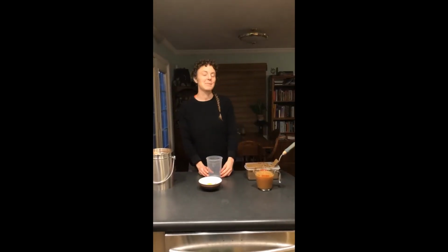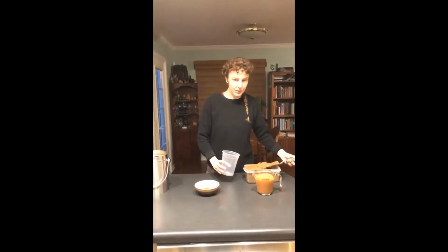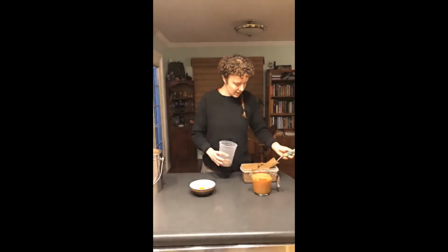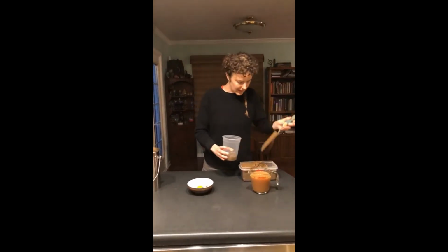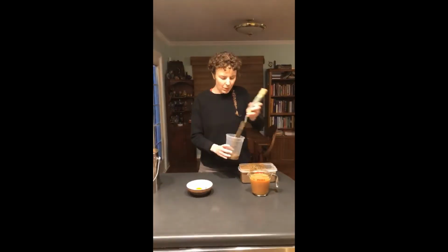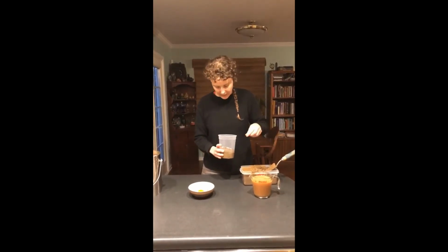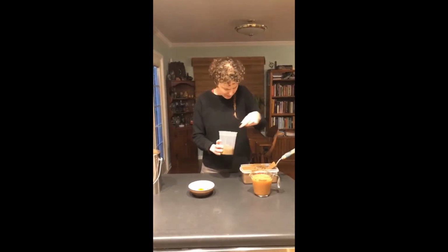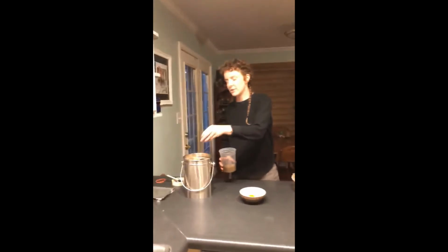All right, now for the fun part. Let's play with some mud. So you're just going to use your trowel to move the mud from one container to your Winogradsky column. You don't want to include really big leaves or sticks or anything like that. So if you see those in there, this is actually pretty good. I was going to do an example, but I can't find any. If you see some in there, you can just throw them in your compost.